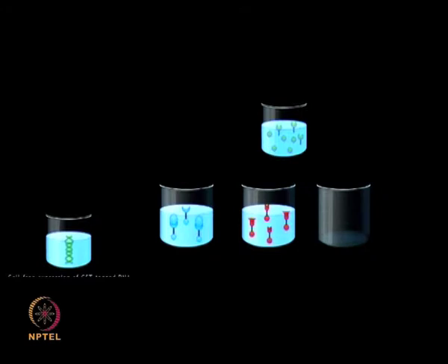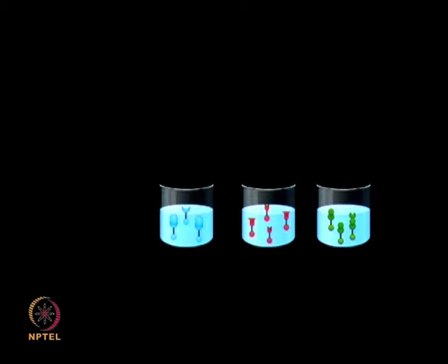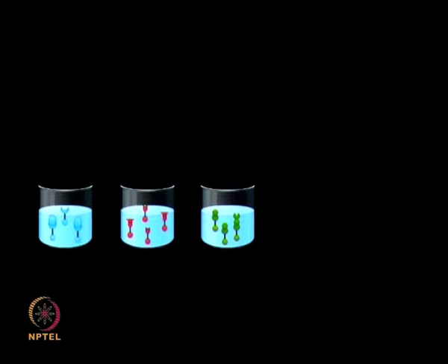Once the expression step was completed, the synthesized proteins were further immobilized onto the beads through the capturing agents. These beads were then mixed together.